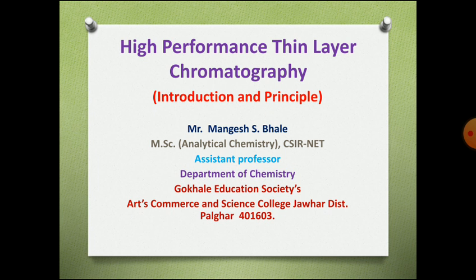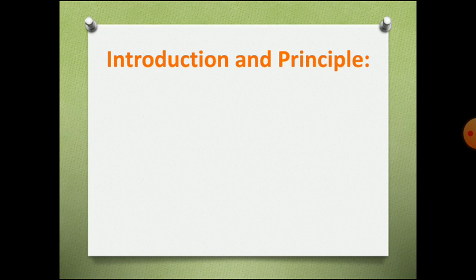We have completed high performance liquid chromatography in the previous lecture. So today we are going to learn the introduction and principle of high performance thin layer chromatography, that is HPTLC.